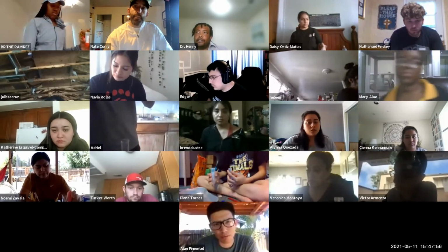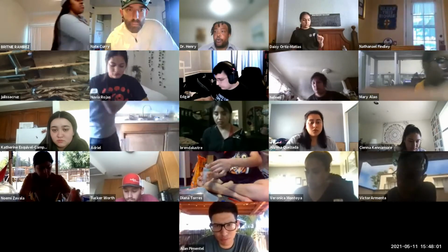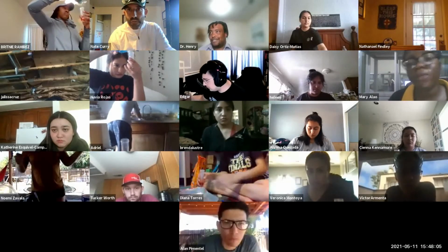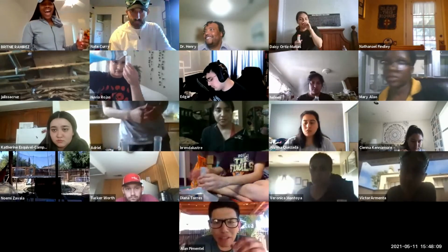Yeah, no, I'm good. I got my numbers now. What do we do after we got our numbers? Okay, so you have your numbers recorded? Yeah. No, wait for us. Wait for me. I have a question. Why if it's not rising up? Is there like a trough? Dr. Henry.